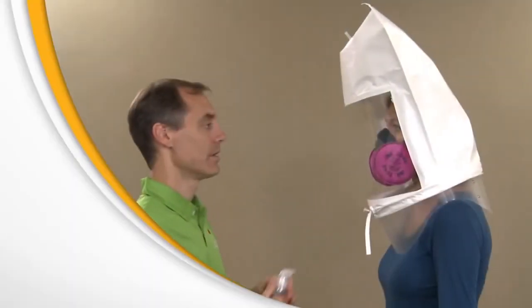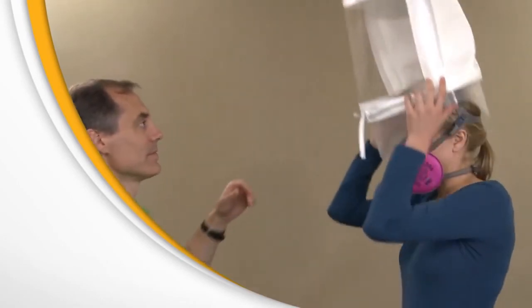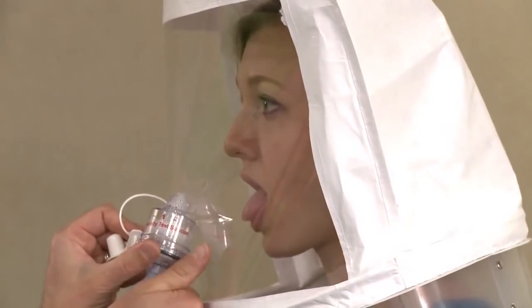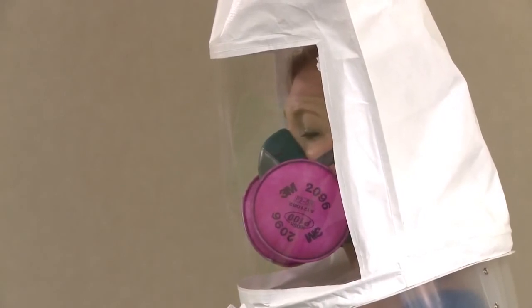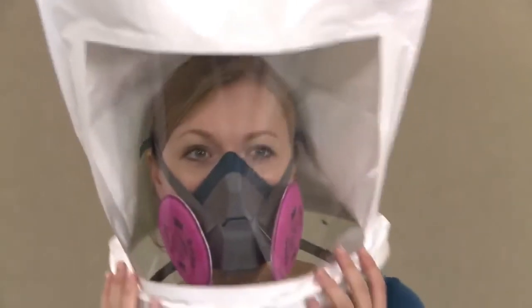If at any time during the fit test you detect the same taste you did during the sensitivity check, inform the instructor immediately. It means that your respirator does not fit properly. You must then refit your existing respirator or select a different size or style of respirator. Once you clear the taste of the test agent from your mouth, you'll repeat the sensitivity test and fit test procedure. If you complete the exercises without tasting the test agent, the respirator fits you properly. You passed the fit test.